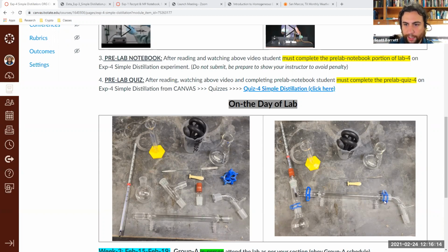And all of these clips are here in order to make sure that everything's sealed. Make sure, if you're in a lab, to put a little grease around the ring. You see here, there are all these little rings, the circular joints that go into each other. You'll want to put a little bit of grease around it so it creates a good seal, because the heat will expand the glass whenever you're utilizing it.